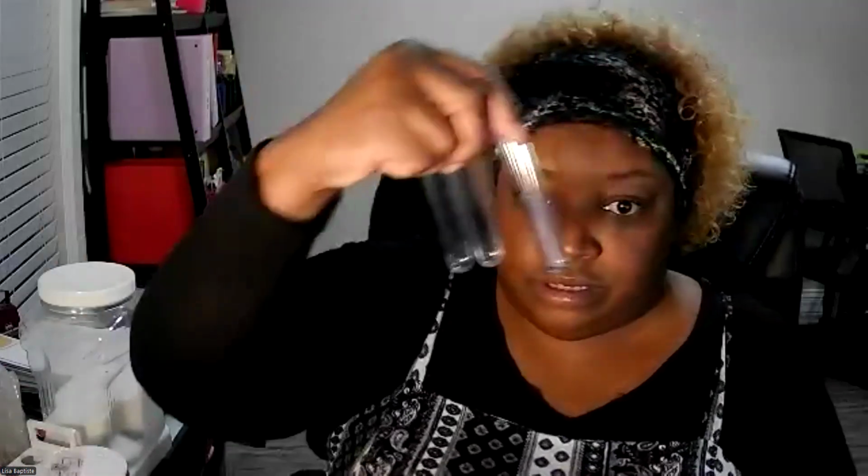All right, the first thing, looking on my table, oh, here we go. I rearranged my stuff. So we have the electronic scale, that's your pocket scale. You have your 10 milliliter graduated cylinder. These things I'm showing you first came in your lab kit. You have your safety goggles here. And then you have your 250 milliliter beaker, and you have 3 test tubes.